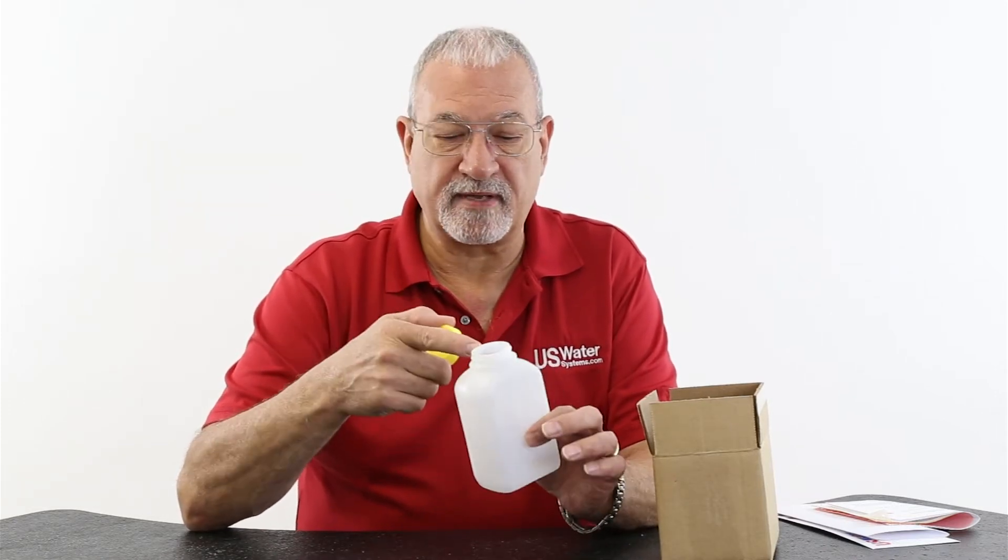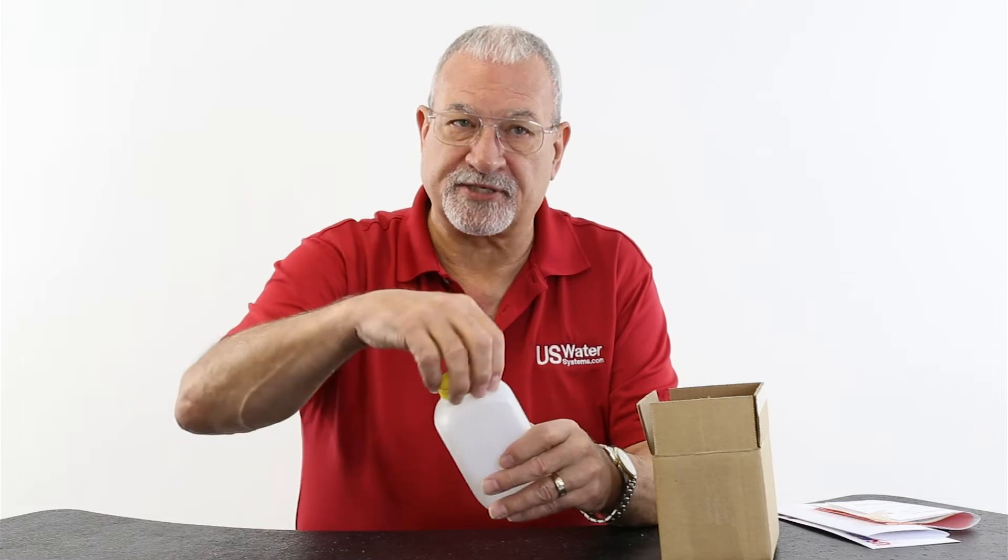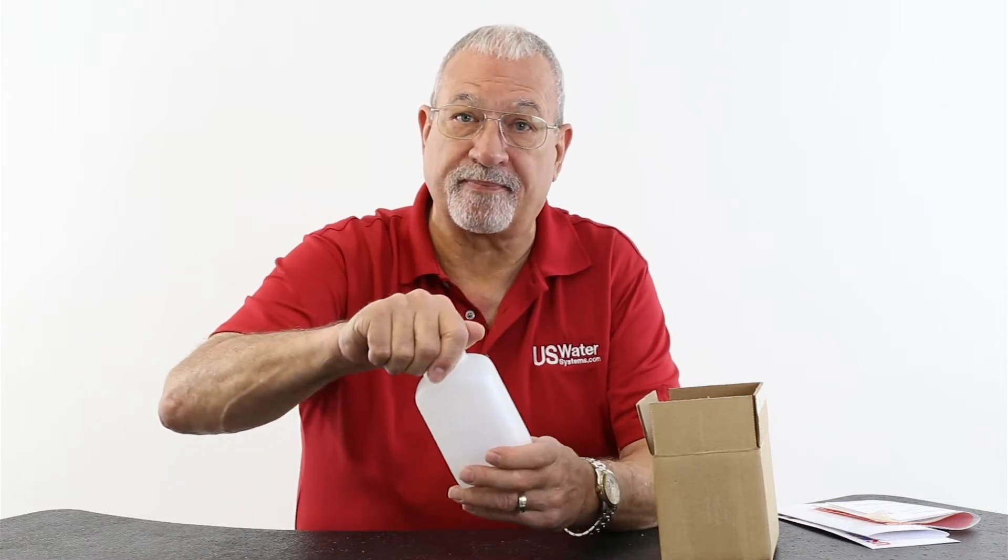Fill this up to within about a quarter of an inch of the top. Cap the bottle, and it's a good idea to put a piece of tape around here just to seal it so it doesn't come loose in shipping.